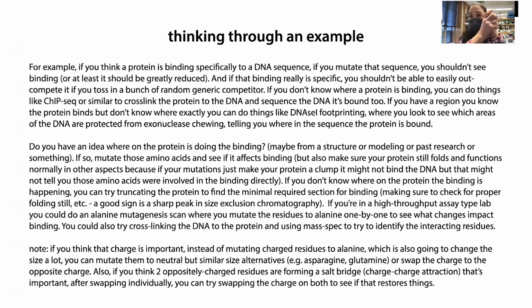The proteins will kind of, it's because they don't have the salts to help fulfill their needs, they'll kind of glob onto other proteins in order to satisfy those needs. And so you'll get more non-specific binding than if those other proteins have to outcompete the salt. So you want to make sure you have a high enough salt concentration no matter what you're doing.